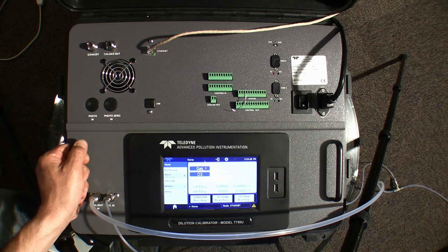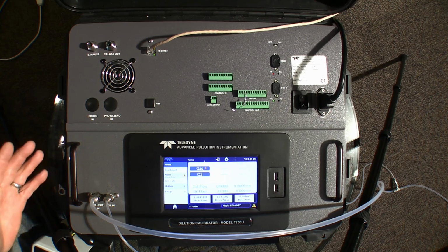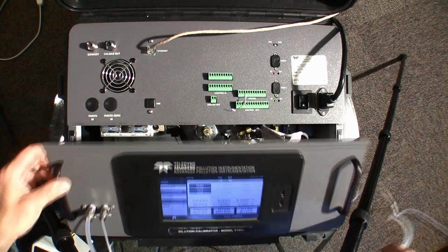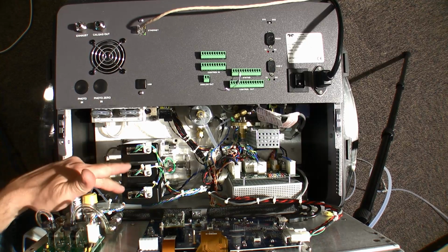One of the key things that we have to do with this instrument is maintaining the calibration of those mass flow controllers. Typically that's going to be something that we do on a quarterly or semi-annual basis, where we at least bring in a flow transfer standard, connect it up to this, and verify or adjust the mass flow controller calibrations. So when we get this instrument, there's going to be 2 screws in this front cover. Pop those screws out, and this cover is magnetically captured here. It's going to hinge open, and you're going to see inside here the 3 mass flow controllers.